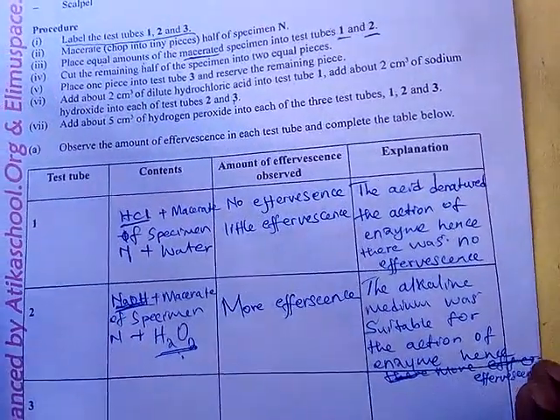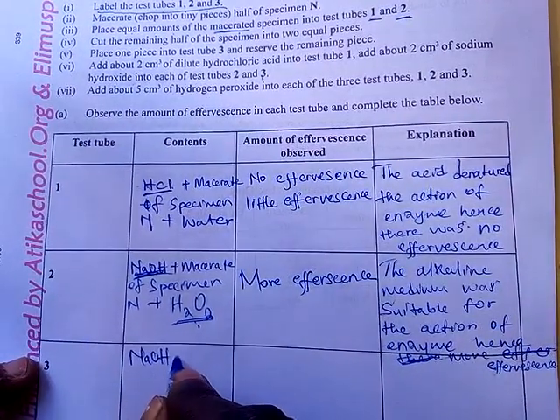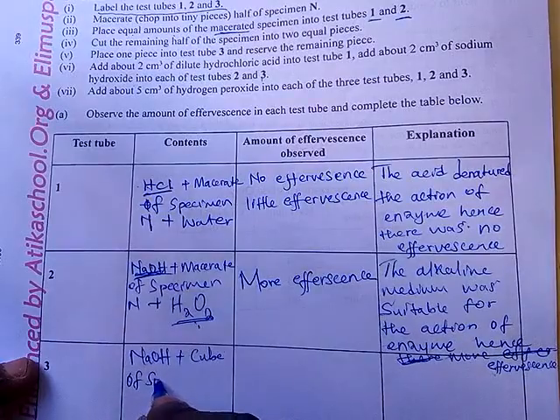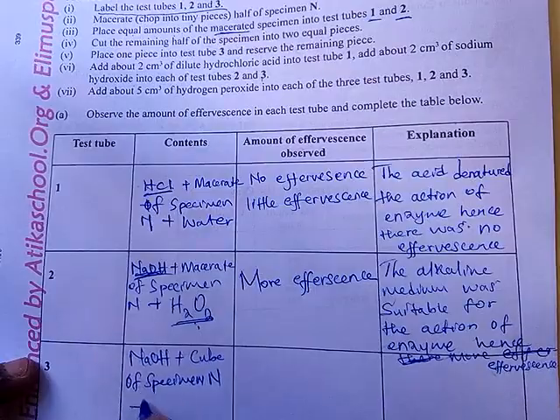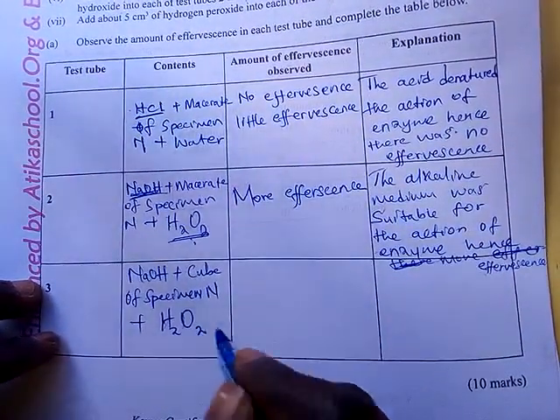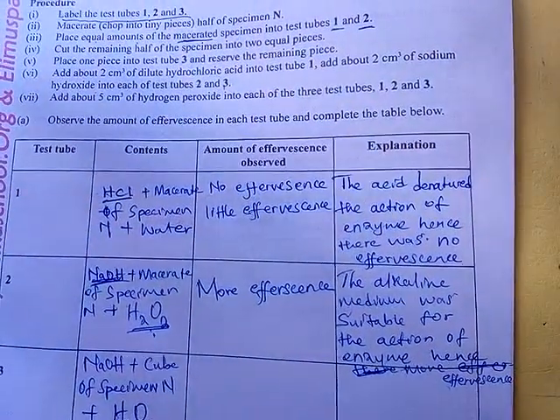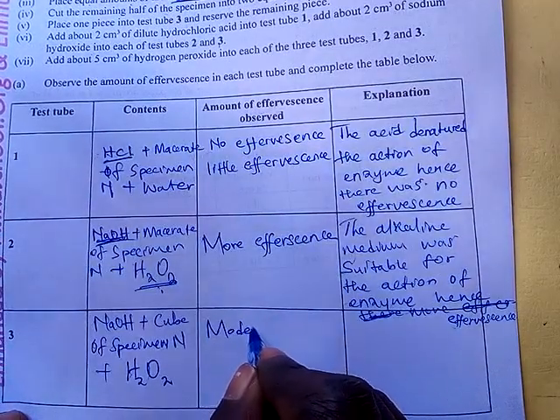Now the content in test tube 3 is sodium hydroxide plus a cube of specimen N, and hydrogen peroxide. Here your observation will be moderate effervescence.